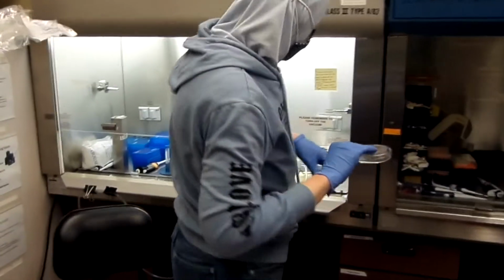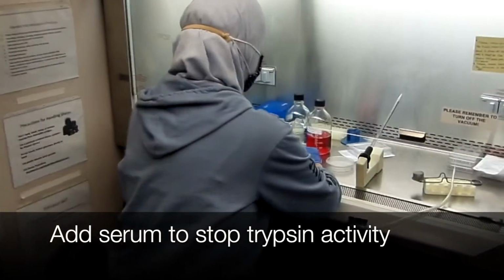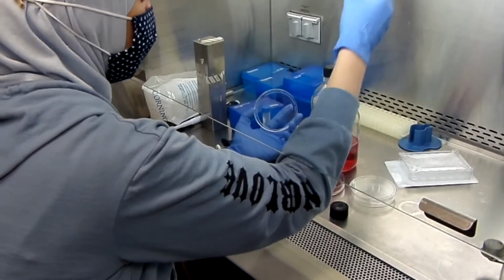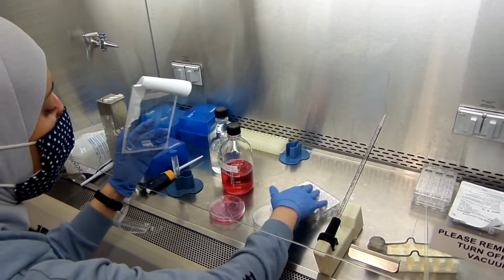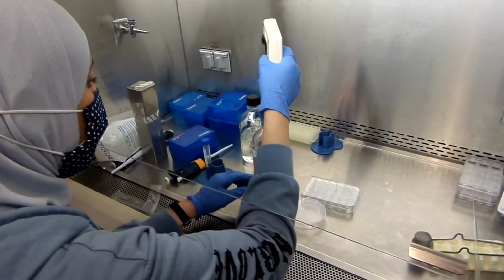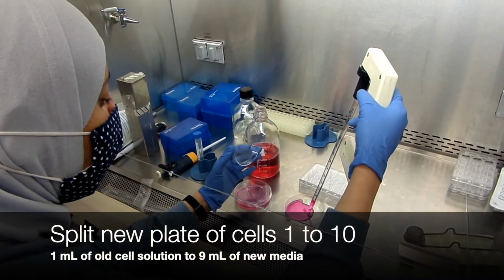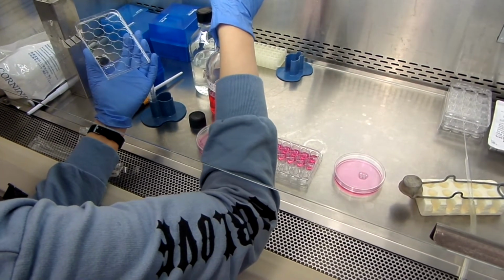In order to end the trypsin reaction, because trypsin is toxic, we will add serum. Serum has anti-trypsin activities. So I will add 8 mL of the growth media that already has serum. That will give me a total of 10 mL. So I have these 24 wells and I have that plate. I want to split my cells or passage them into a new dish, because again, if they are over confluent, you will lose the identity of these cells. And I want to split them 1 to 10. So I added 1 ml of media, to which I will add cells for my next experiment.